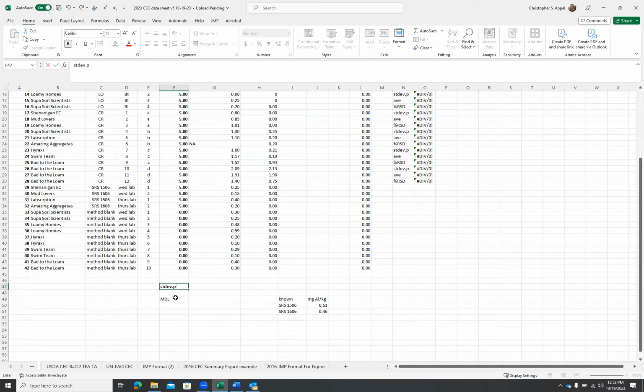Pretty poor, right? Precision. Which, when you're not measuring much of something, when you're measuring something that's close to the detection limit, usually your precision is pretty bad, right? And we're close to the detection limit. So that's why our precision is not so good.